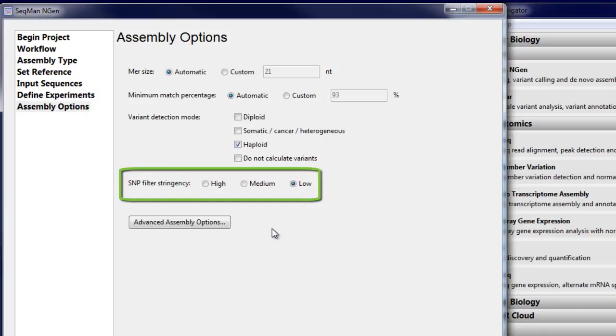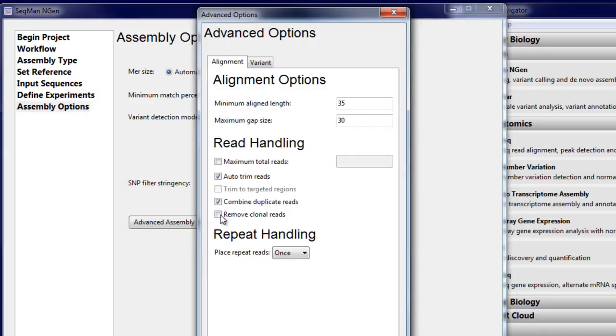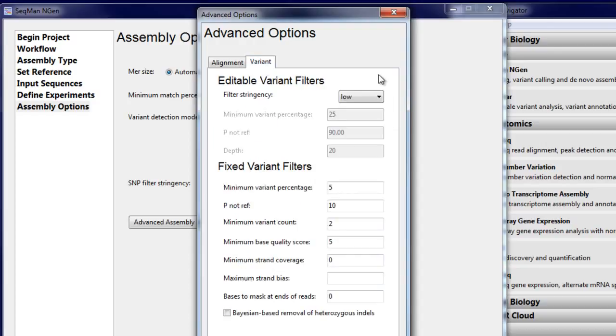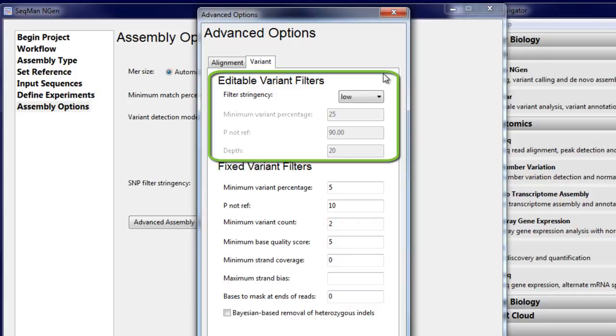You can also adjust the SNP filtering stringency. Note that in the Advanced Assembly Options, there are several variant filters available. The filters listed at the top of the window can be adjusted after assembly.